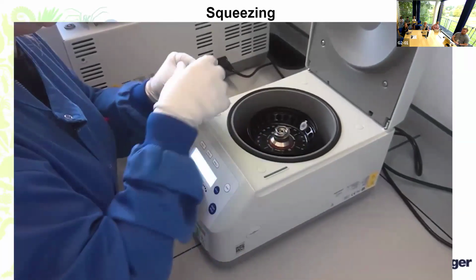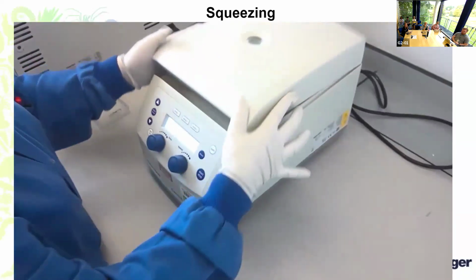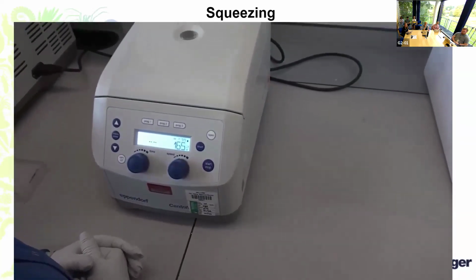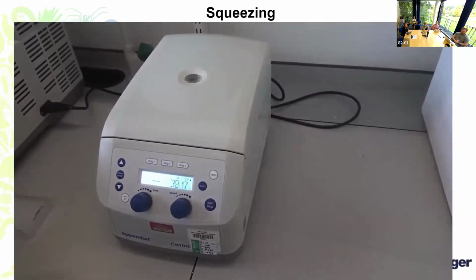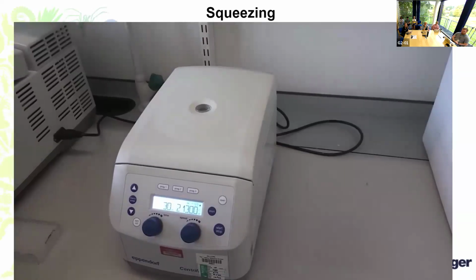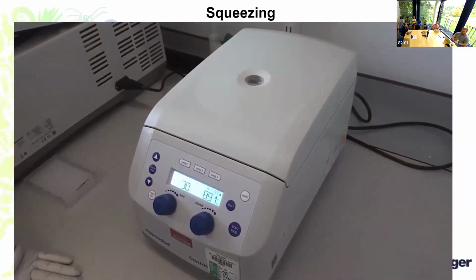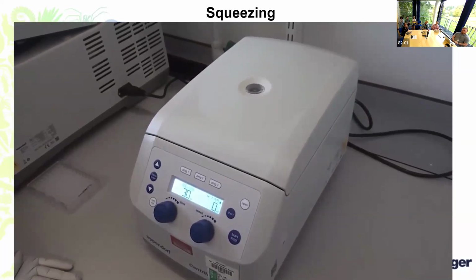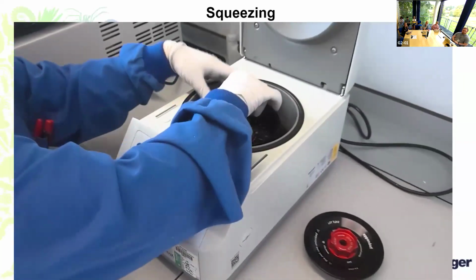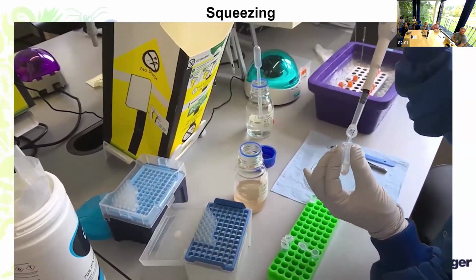So once this has been done, we now spin the tubes down at a maximum speed for up to 30 seconds, with the intention of pelleting our cells at the bottom of the tube. Once this is complete, I'm now going to take off the waste off the tubes, and then try and get all of the contents from the second tube back into the first tube. Doing it this way, I can maximize the size of the pellet that I have at the bottom, rather than just using the one tube.